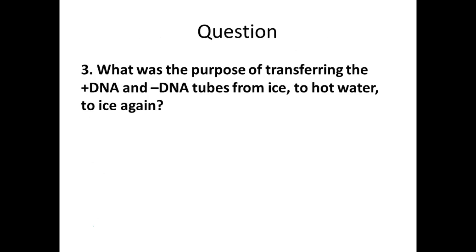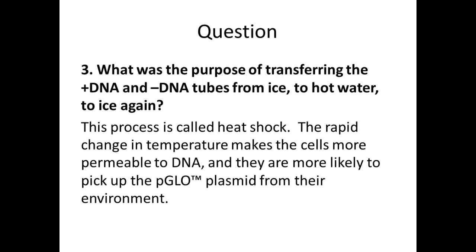Why are we doing this? Why are we going from ice to hot water to ice again? Yeah, it's going to help with the permeability, and it's a process we call heat shock. And it's basically a stressor. Because remember, in stressful conditions and environments, this is when they are encouraged to take up DNA.